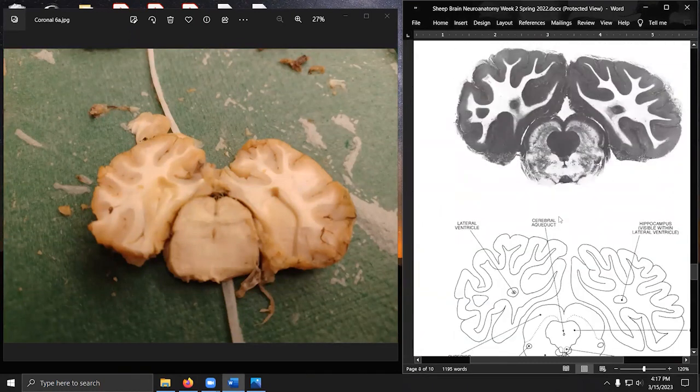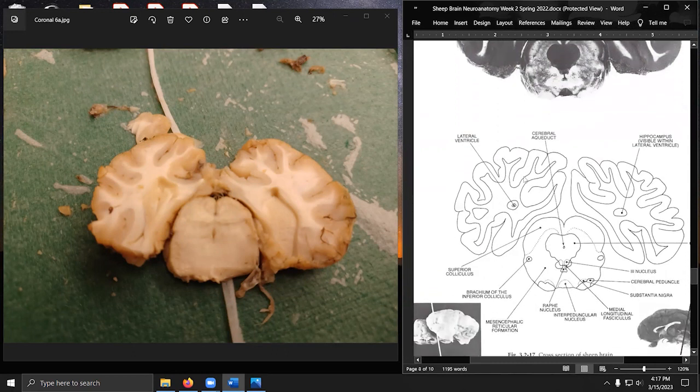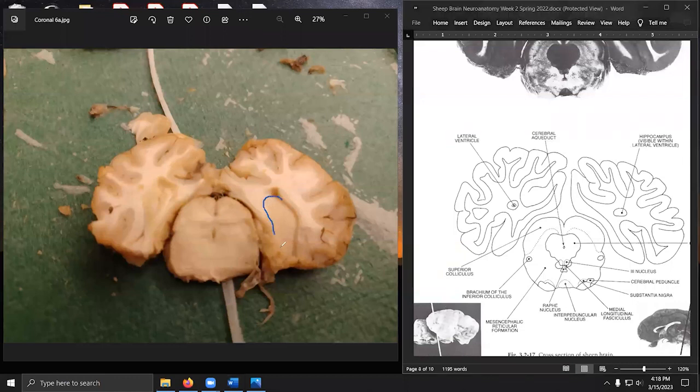So our sixth pair of images, we see first staining that exemplifies the gray matter, keeping the white matter white. And we see down here, it says lateral ventricle. And what you kind of see here is that there is a gap here. That is the lateral ventricle. Keep in mind that the lateral ventricle is surrounding the hippocampus. So once we remove the backbone of the hippocampus, that exposes the groove in which the lateral ventricle existed. Ventricles are gaps in this case, since they are no longer fluid-filled pockets once the brain has been drained of excess fluid. In this case, the hippocampus is still partly wedged in here, but if we were to remove it, that would be the wall of the lateral ventricle, which we see kind of peeking out behind it up here.